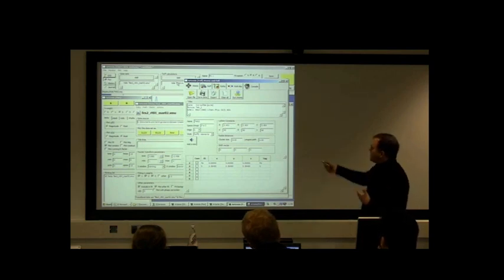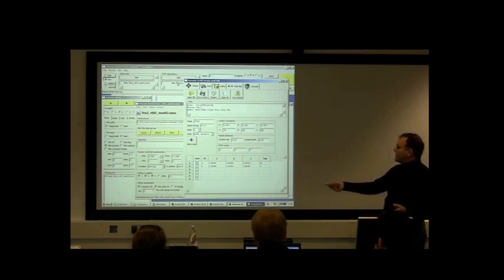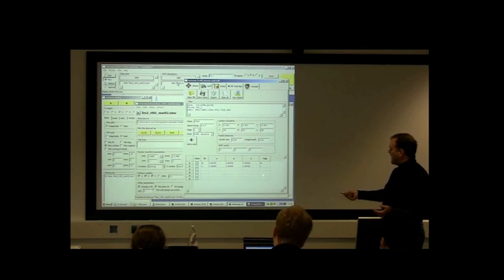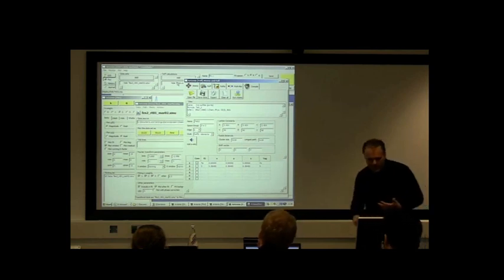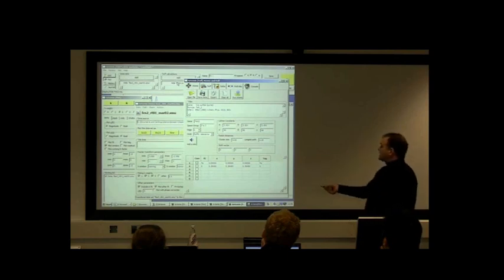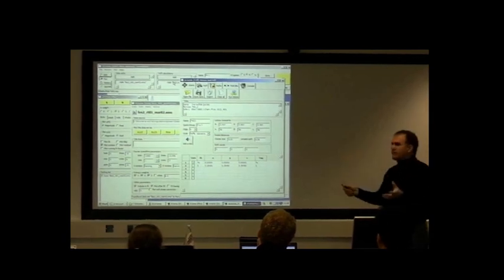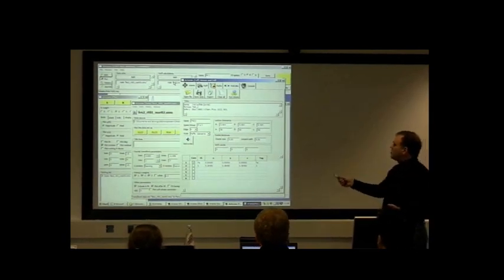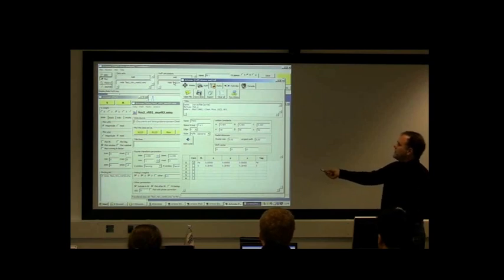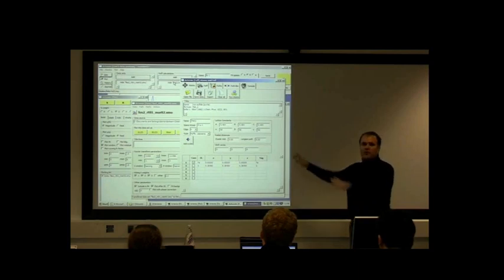You then, inside the unit cell, the crystallographic unit cell, you have some iron atoms and some sulfur atoms, and it looks like it disconnected again. So you have some iron atoms and some sulfur atoms, and the unit cell gets populated with iron and sulfur atoms according to the symmetries that are encoded in this space group symbol. So I mean, all that crystallography stuff about how you make a unit cell of a crystal, that's stuff that the software knows how to do.